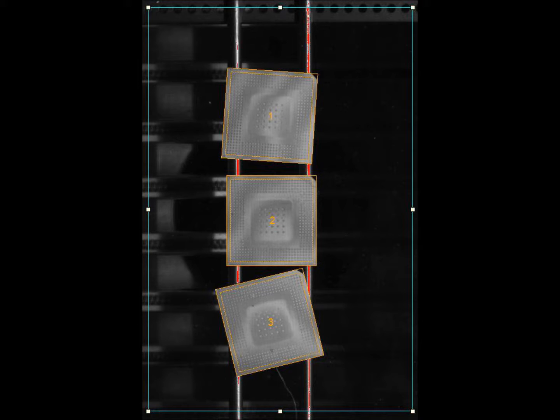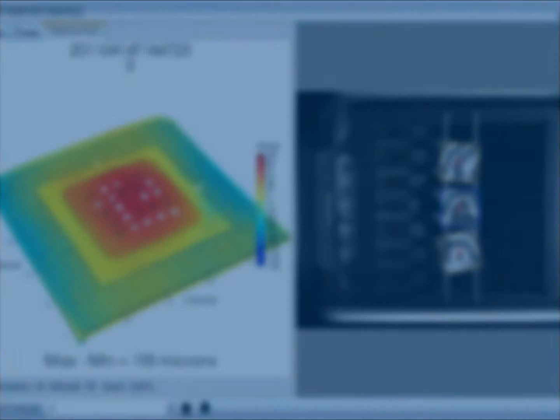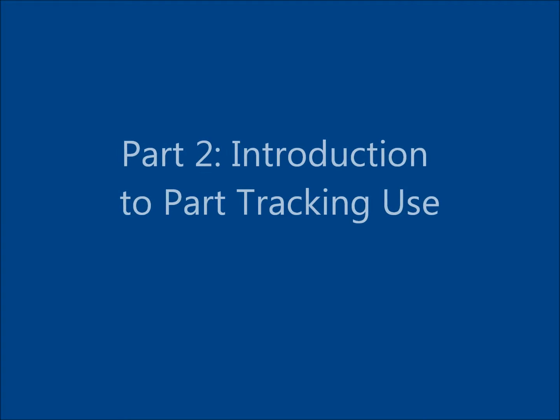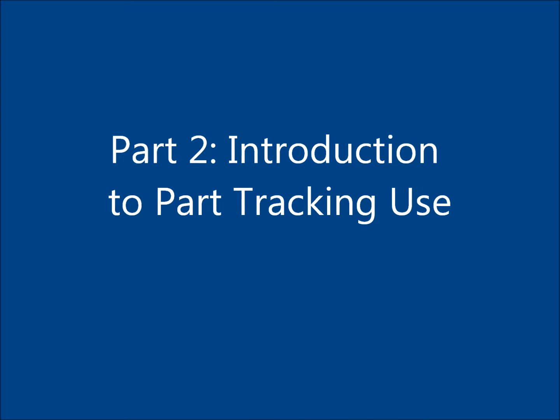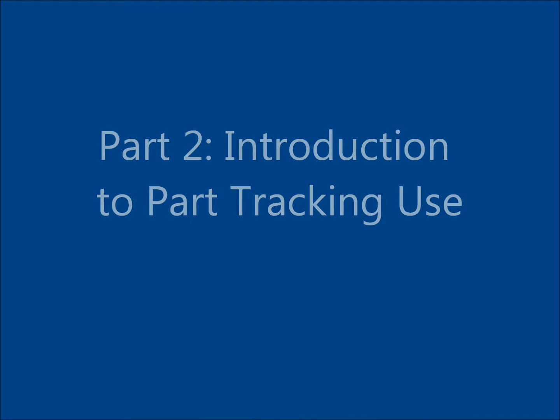In the previous examples we showed processing of 6 samples, a reasonable test case with the Studio software. However, imagine the benefits of the part tracking technology of trying to test 50 samples at once. This is not only possible but straightforward with part tracking. Now in part 2 of this video we will go over the basics of how part tracking is used. This section covers the basic workflow and choices that will need to be made in using the part tracking feature.